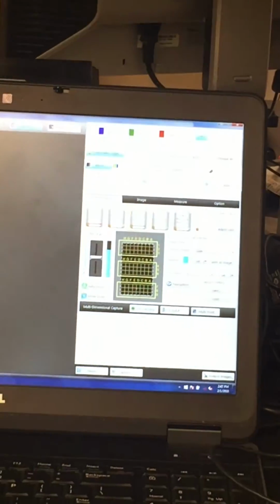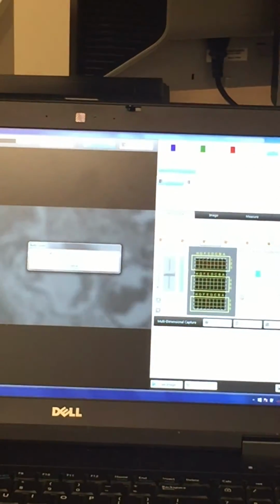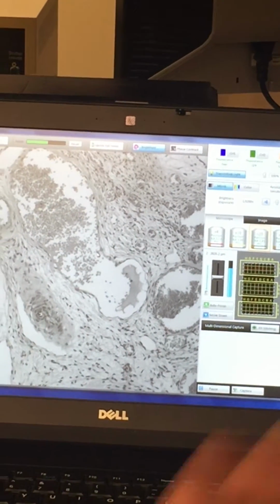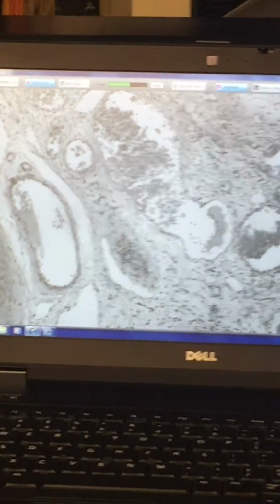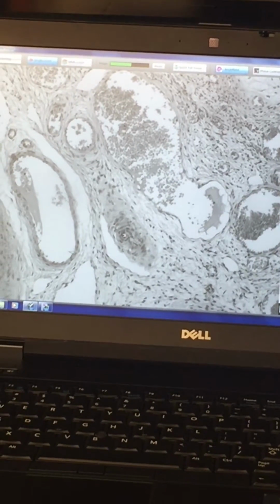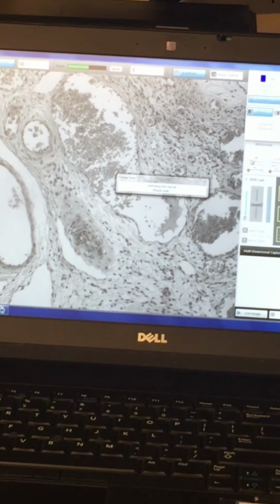Okay, because we've had people before who bought the system hoping it could scan an entire slide at like 40x. You're going to have to do it in quadrants, because of the pixel limit of this microscope. If you're trying to scan an entire slide at that high magnification, you'll run into issues. But basically, how you're going to set that up is just go to 4x, or go to the lowest magnification that's in the system.